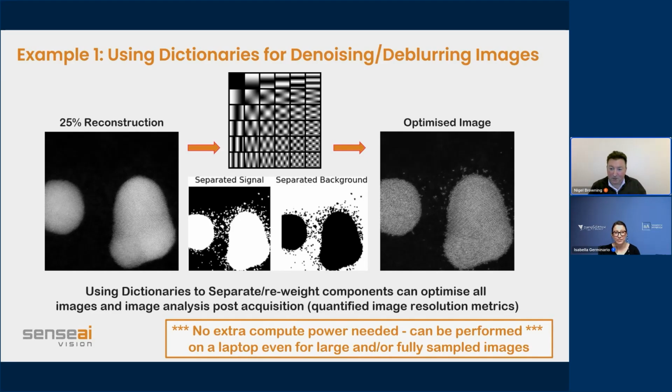We can go below that, but then it becomes a little bit more of a problem in terms of the accuracy. We already know what that accuracy is as well, and we can quantify that because, again, the easiest way to test it is something you have a ground truth you can measure it from. And so we know that if you then try to do an unknown experiment, you're going to have a certain accuracy or a certain error bar associated with that reconstruction, which means you should be able to deal with it accordingly. But above 10%, in every test that we've done, we're pretty much sure the reconstruction will get us something where it's in the eye of the beholder.